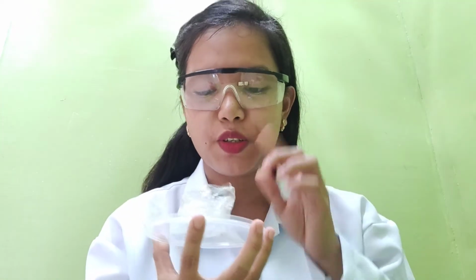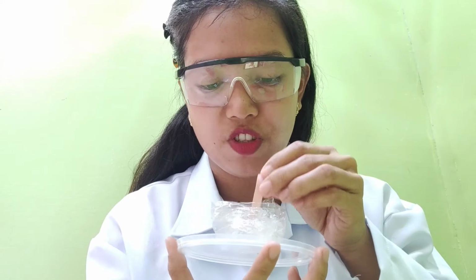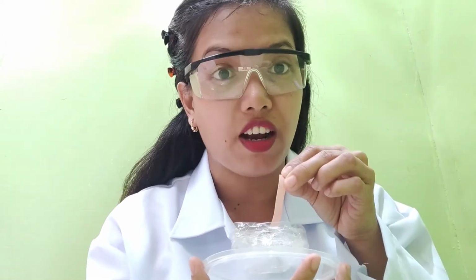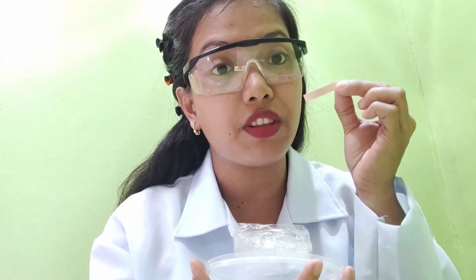So ngayon naman, i-check natin ang vinegar. Inilagay ko lang siya muna sa isang cellophane. Okay, so we will check if vinegar is an acid or a base. So first, let us use a red litmus paper. Check. Okay, so makikita nyo, pagkatapos kong isawsaw ang litmus paper dito sa vinegar, color red pa rin siya, still the same.